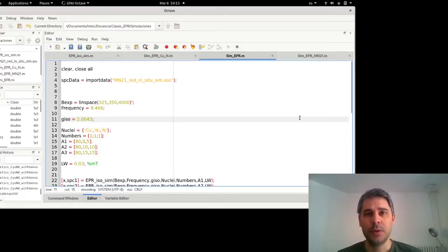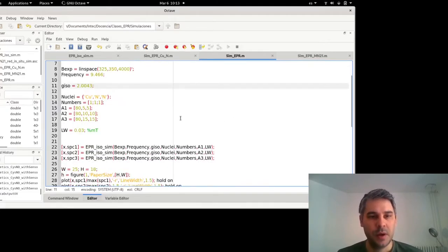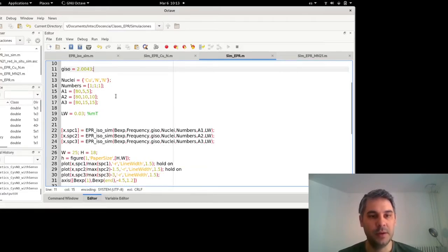Hi, welcome to the fourth video in the EPR series. This is going to be a little bit more on hyperfine splittings, and we're going to try to simulate experimental data. So first, I want to show what happens when you increase the number of nuclei and what happens to the resolution of those hyperfine lines.